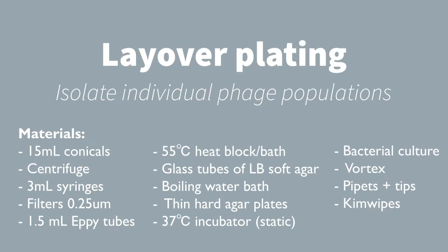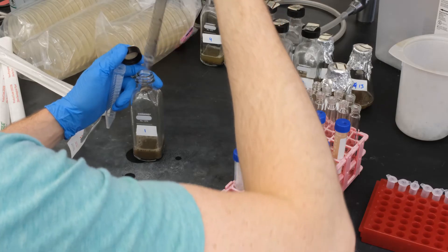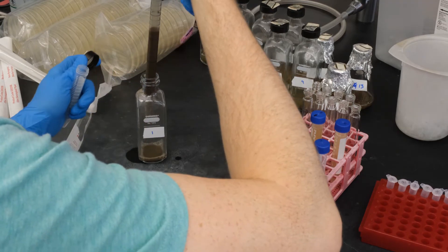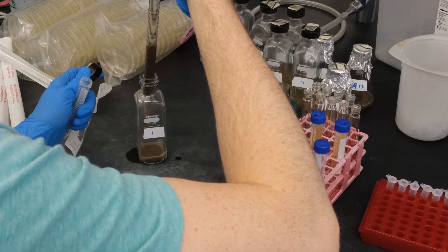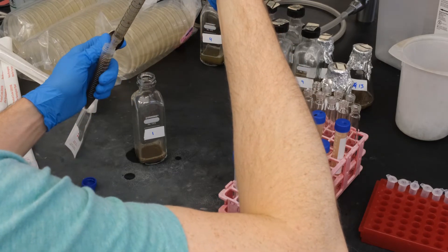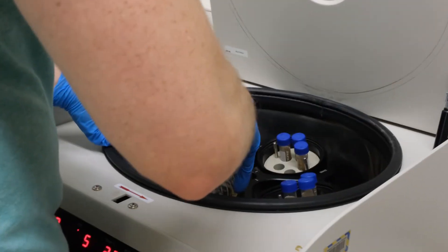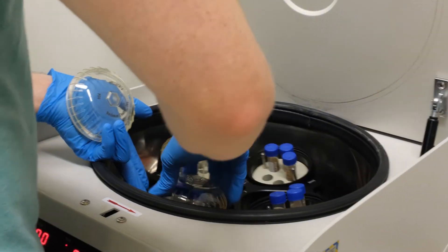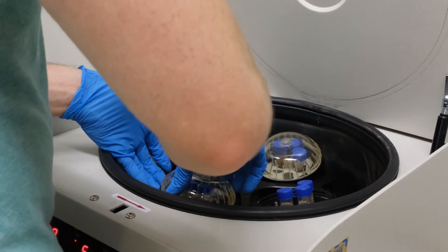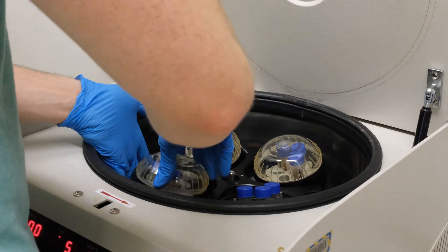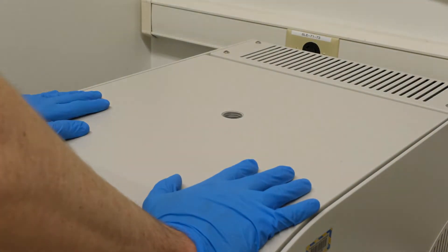To isolate phages from our environmental samples, we are using layover plating. Transfer the enrichment culture that you grew last night to a sterile 15 mil conical vial. Here we've swapped in cultures grown in milk dilution bottles. You can also use flasks like we showed yesterday. Centrifuge at 4°C as needed to pellet debris. Here Tyler's doing just 1000 RPM for five minutes, but we've seen protocols that go up to 15 minutes at a maximum RPM, which for this rotor is 4700.